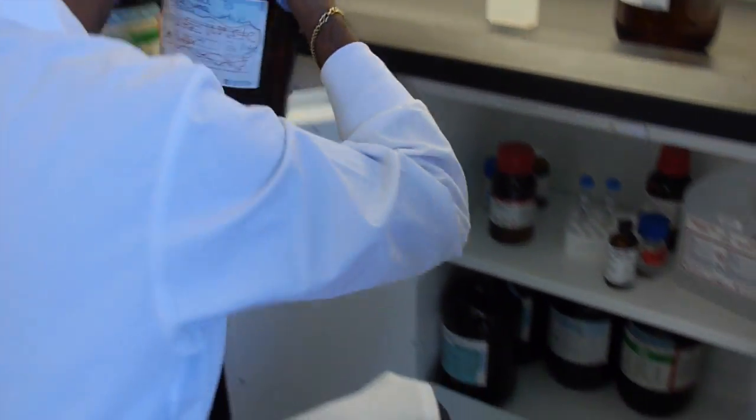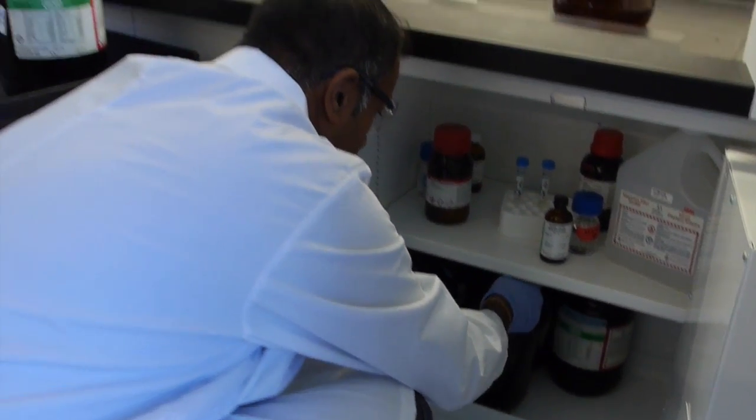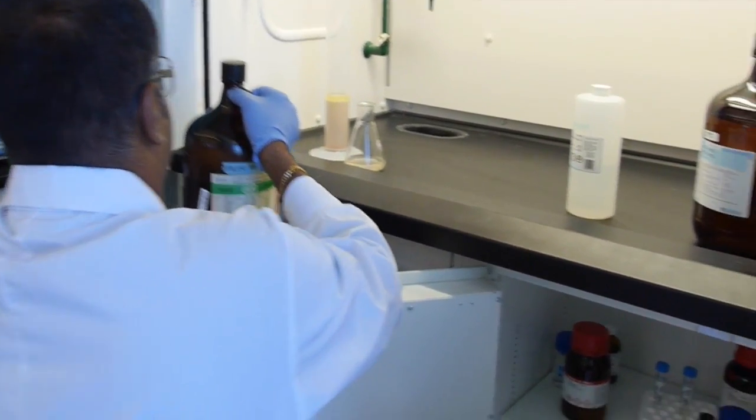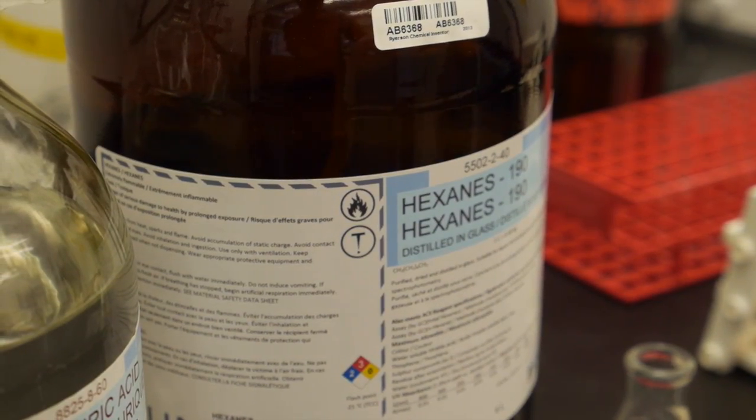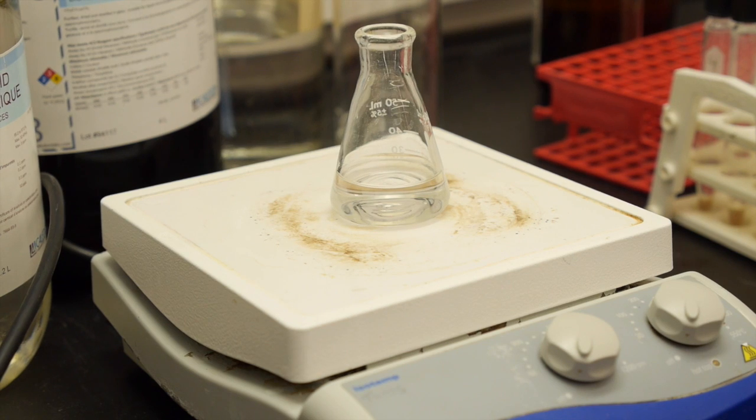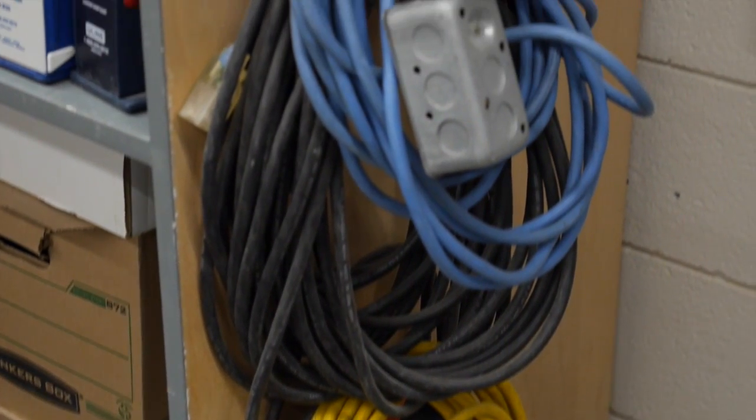When conducting an experiment, keep the smallest amount of chemicals in the fume hood needed to conduct the experiment at hand. Work with flammable chemicals should not be conducted in a hood that contains hot plates, open flames, or equipment that generates electrical sparks.